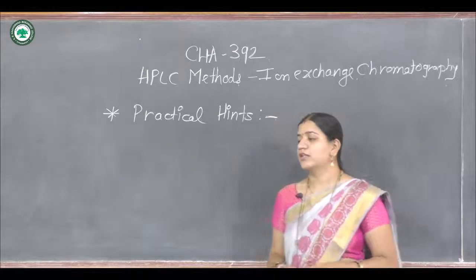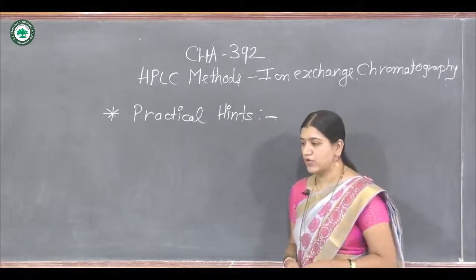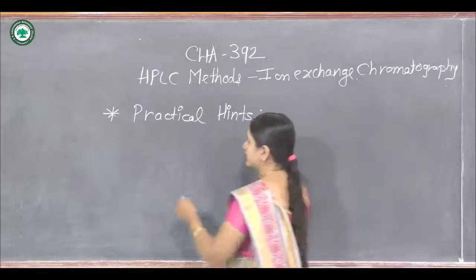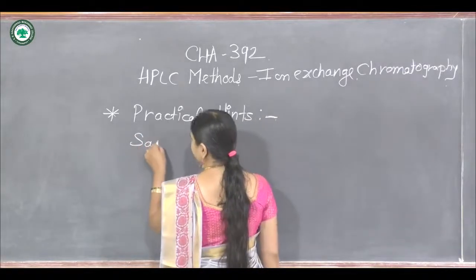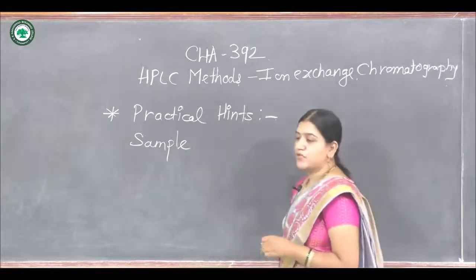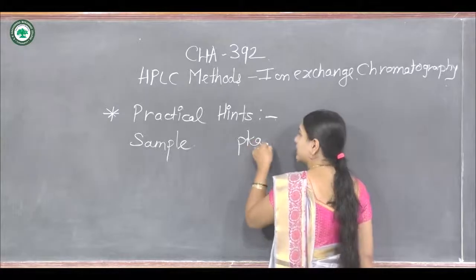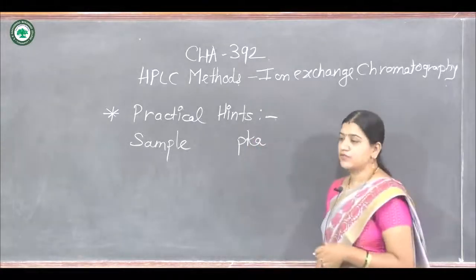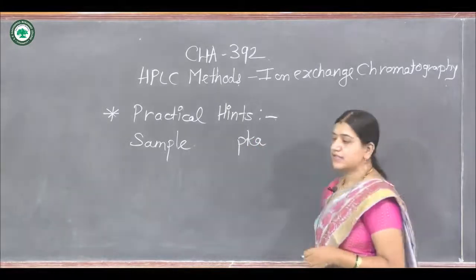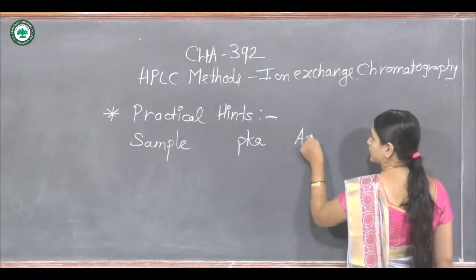So in the case of the sample, the pKa value related to the sample, and the appropriate pH for the elution.